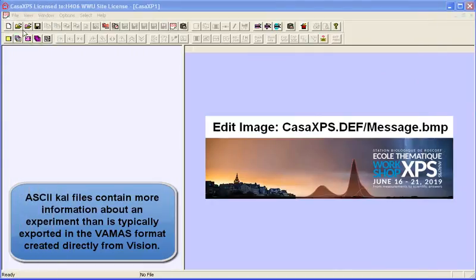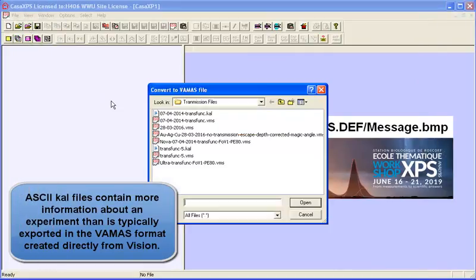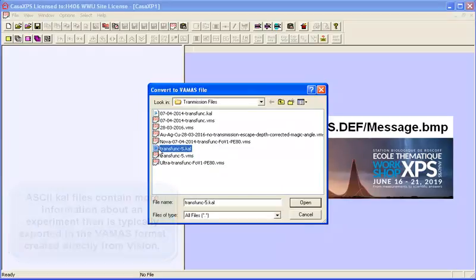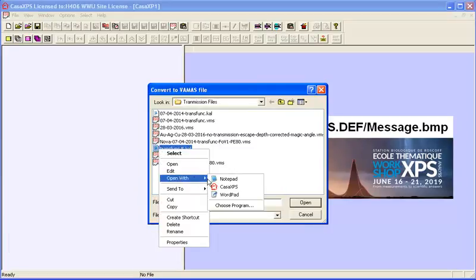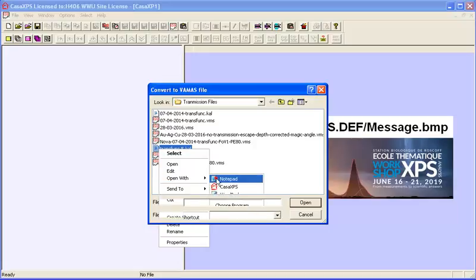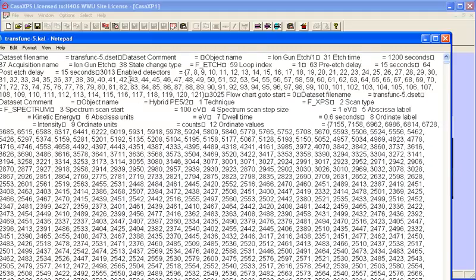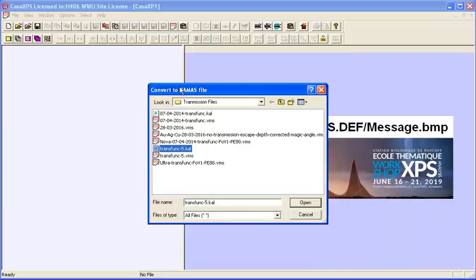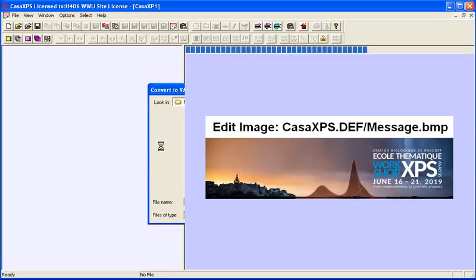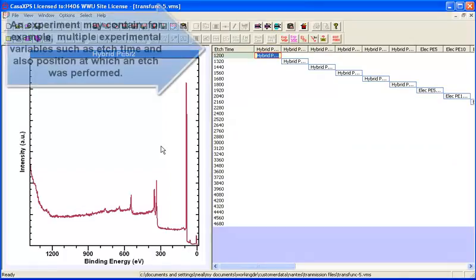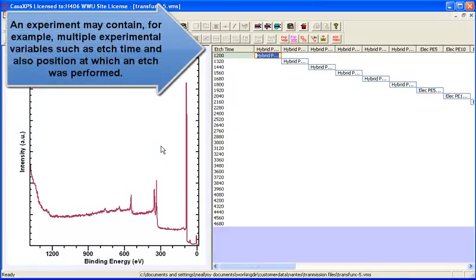Kratos vision data can be converted to an ASCII equivalent from the binary files. If you look at these ASCII equivalent files, they contain information about the experiment, and if provided in this format, then CASA can convert these data to include additional information that might be missed in other forms of VAMAS files when exported from data systems.